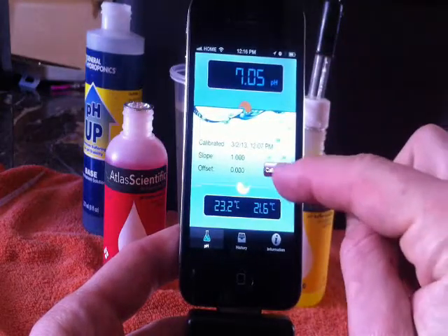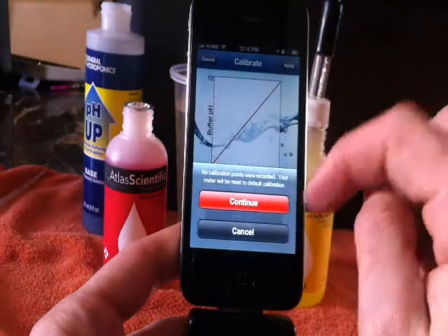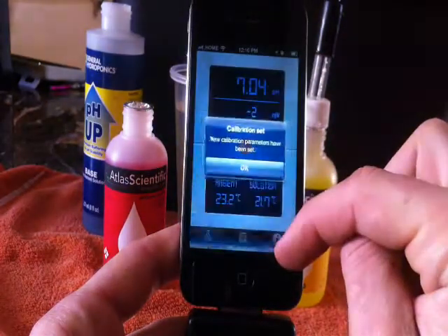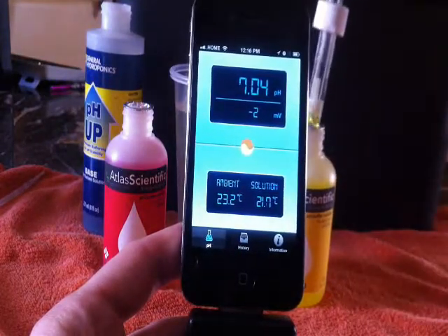Calibrating it is very simple. Hit the middle button and it's going to find which testing solution you are in to calibrate. Push a button and you're done — very simple to calibrate, easy and fast.